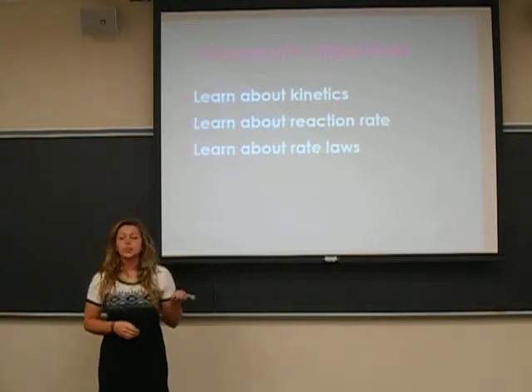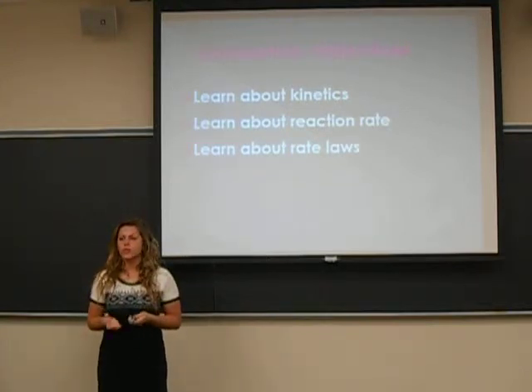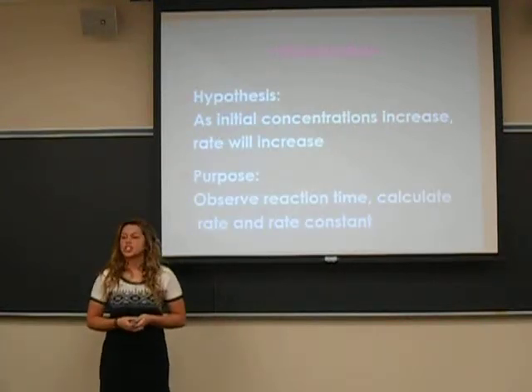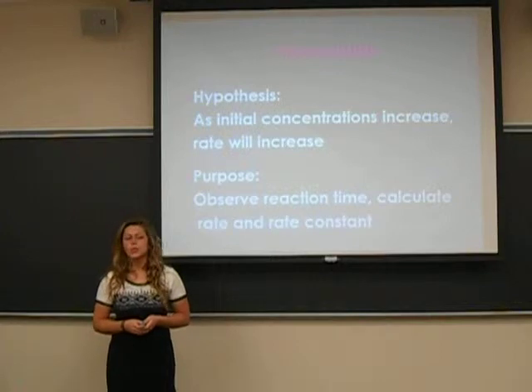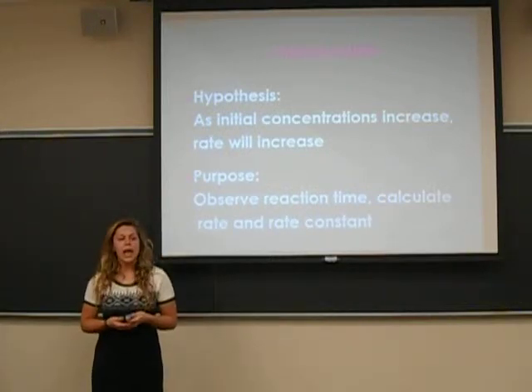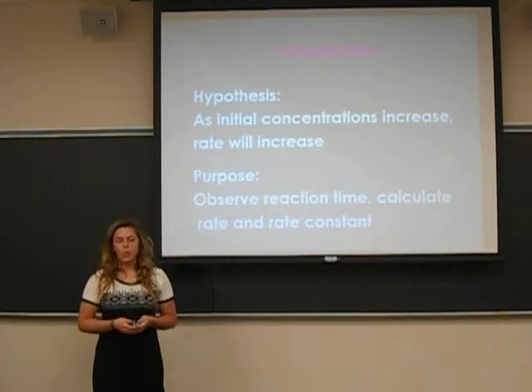So our objectives were to learn about kinetics, the reaction rate, and rate laws. The hypothesis was that as the initial concentration increases, the rate would also increase. And the purpose was to observe the reaction time, and we wanted to calculate the rate and the rate constant, as well as kinetic order.